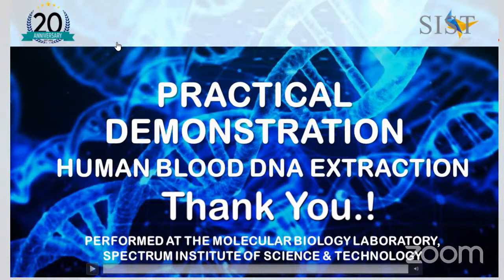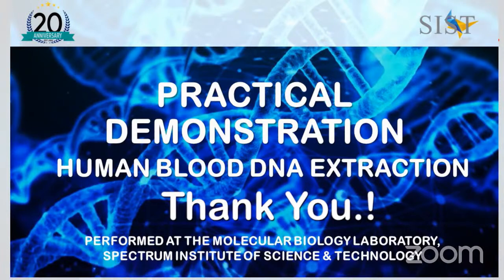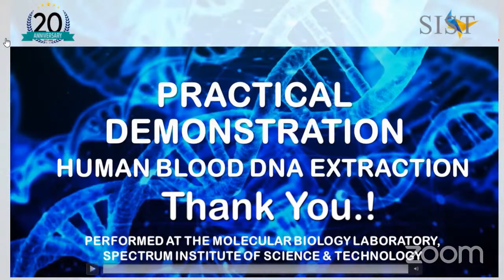So that video concluded how the human blood DNA is extracted in a laboratory. Okay, so in this procedure, we were obtaining the DNA from the white blood cells, right? Because red blood cells, the major erythrocytes, don't have a nucleus. Therefore, the extraction of DNA is taking place from the white blood cells.